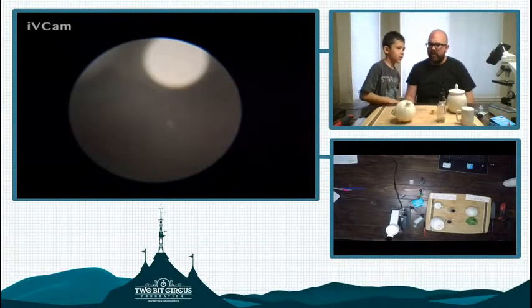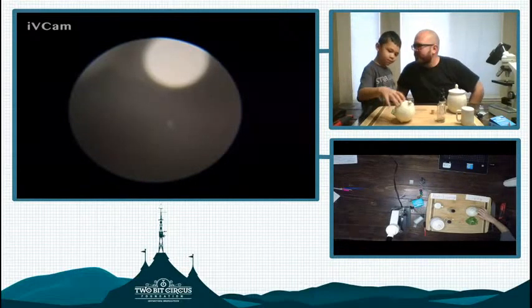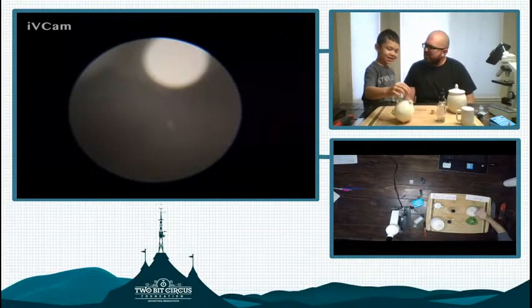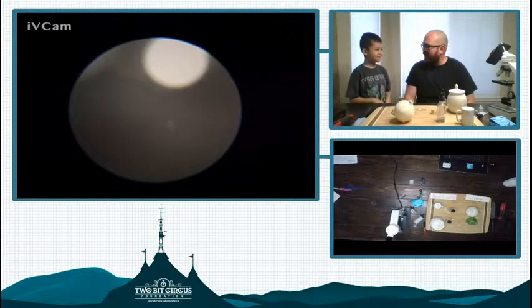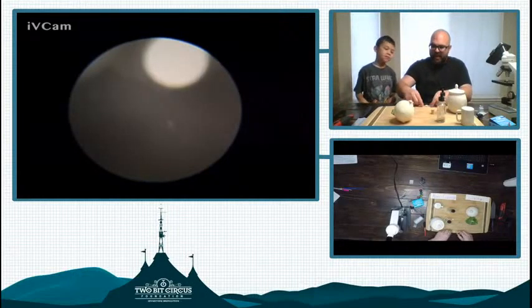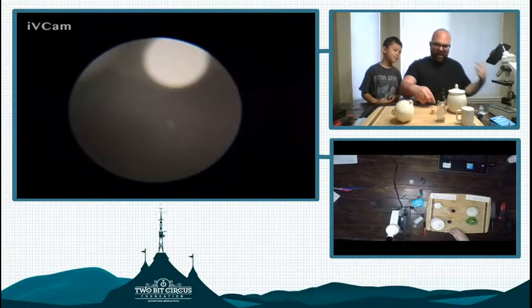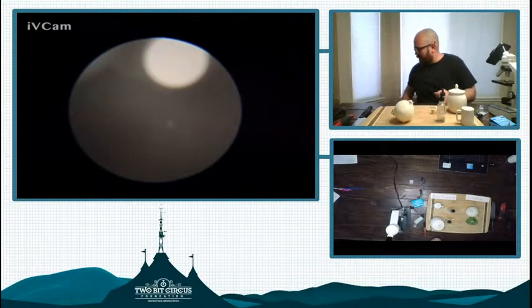So how do we have to prepare our slide to put it under the microscope? Okay, we can look at that. You want to take a little bit of skin and look at that under there too? Do you call that skin? I don't know. What do you call the outside of an onion? The outside layer. There we go. Awesome, Robert. You want to come on the other side now? Because you're going to be a scientist right now, and then later you'll be part of our experiment as well.